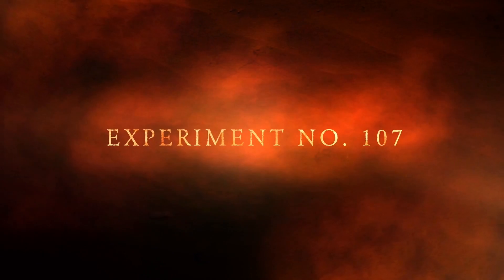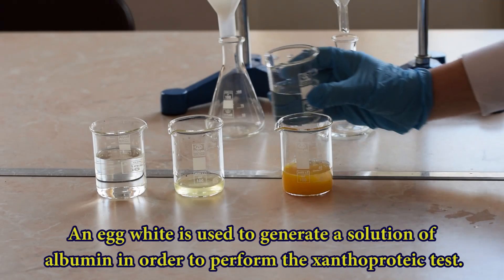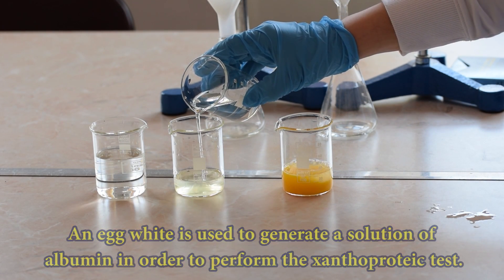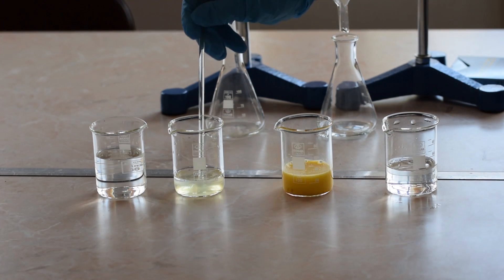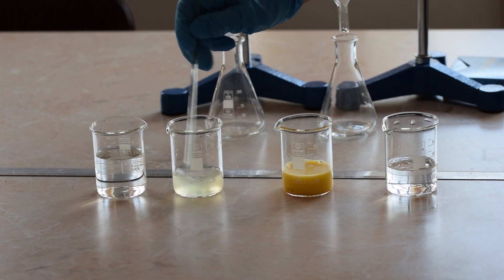Experiment number 107: The Xanthoproteic test. The Xanthoproteic test is another way of identifying proteins in a solution. To perform this analysis you will need a solution of a soluble protein, for instance a solution of egg albumin.